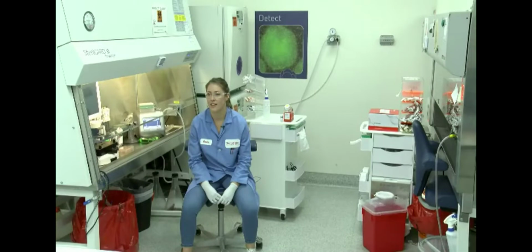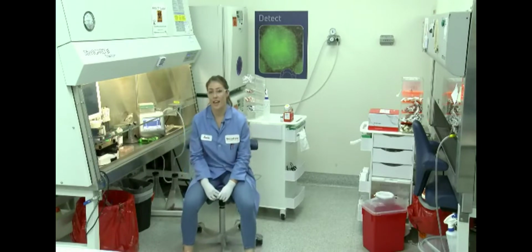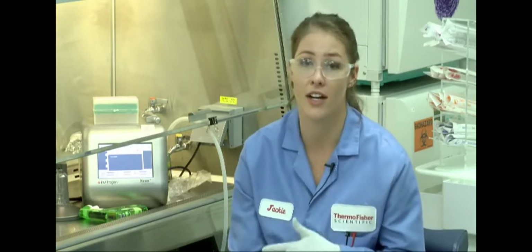Okay. So in terms of using the Neon for genome editing, would you really recommend using the Neon, or do you think that Lipofectamine Stem would also work? For genome editing specifically, I would definitely recommend using Neon electroporation because, like I said earlier, in genome editing you're really concerned with getting a high transfection efficiency, and the Neon electroporation system will give you a much higher efficiency than something like Lipofectamine Stem.